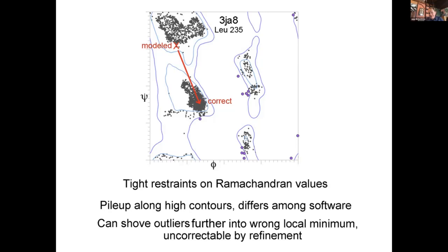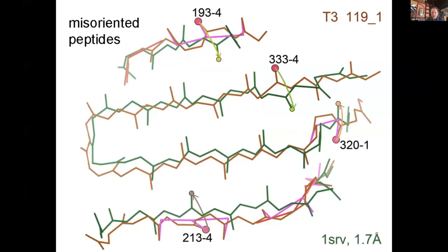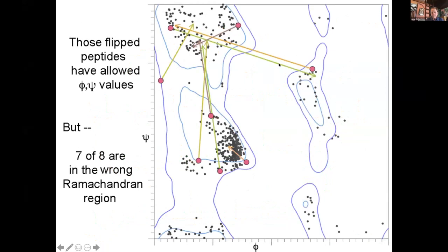Usually when you have a peptide misoriented, you will get two bad Ramachandran outliers that go to the wrong place, and so the refinement actually pulls the structure in the wrong direction. Here's a beta example with several, and all but one of them ends up in the wrong minimum on the Ramachandran plot — one of them just moves better into alpha, which is what you would want, but it usually doesn't happen.